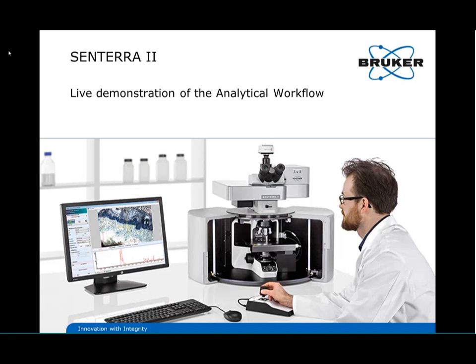Today, we would like to present to you a real-time live demonstration of a Raman imaging measurement with the new SENTERRA II Raman microscope. Before we start with a live demonstration, let's have a look at the concept and features of the new SENTERRA II.